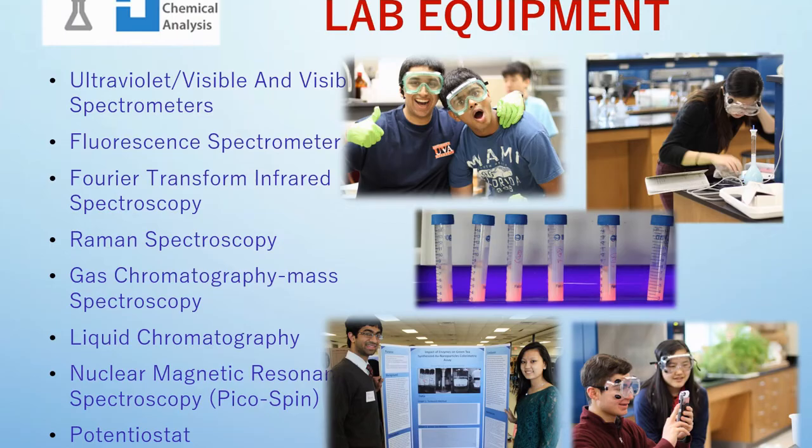As I pointed out in the lab video, we do have a variety of equipment in the chemistry research lab. Most of that is used by students in their research projects. Oftentimes students come back and comment on how the lab is better equipped than a lot of the small college labs they've been to outside of TJ. Overall, we probably have about $500,000 of advanced chemical instrumentation. Most of this, again, is available for students in the research lab, but we will learn about them within the organic chemistry elective class.